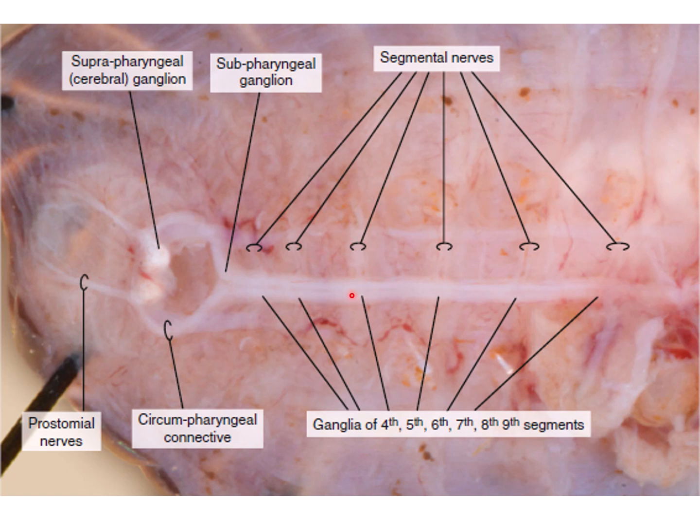Each segment has a slight enlargement, also called a ganglion, and these ganglia extend lateral segmental nerves.